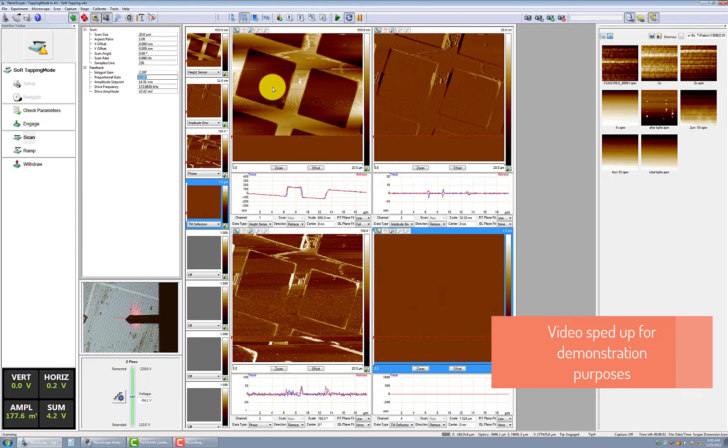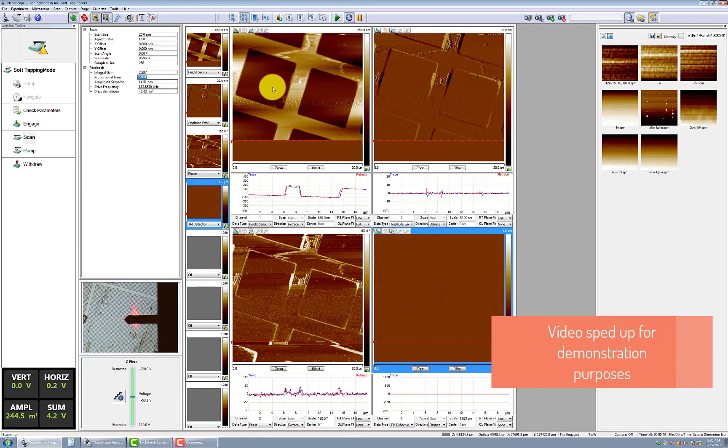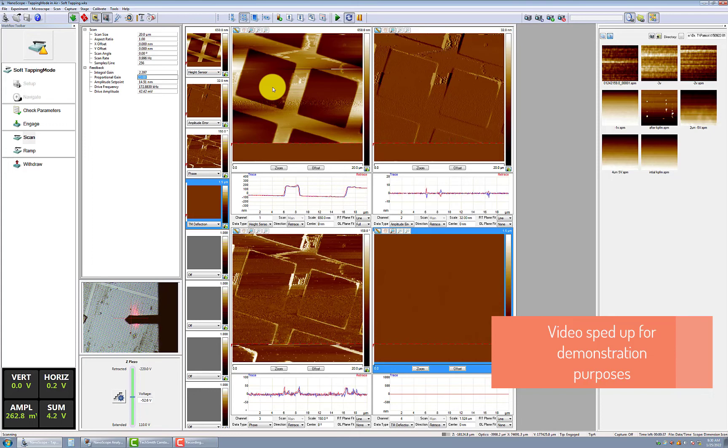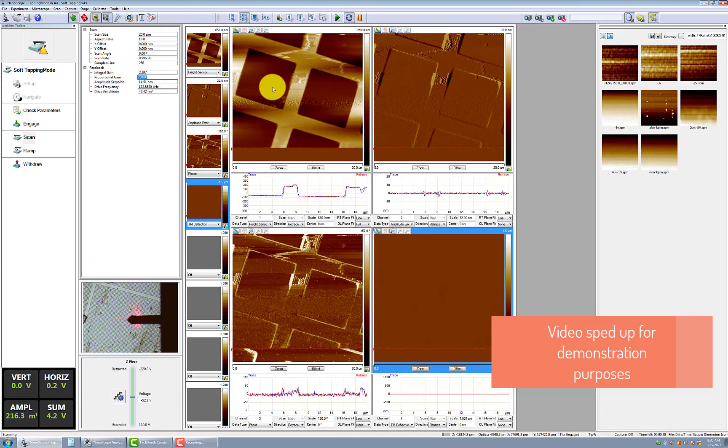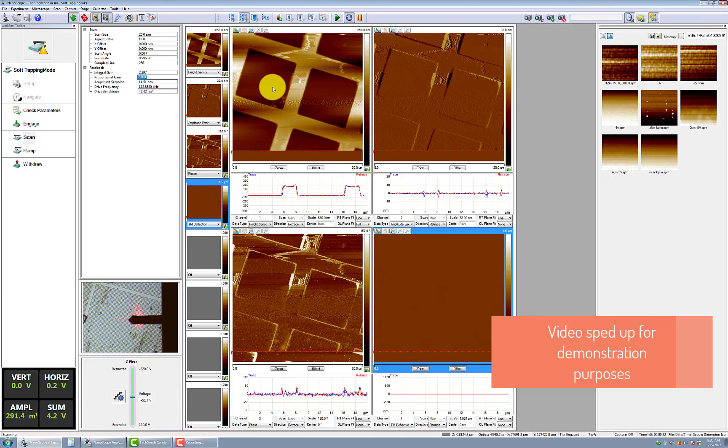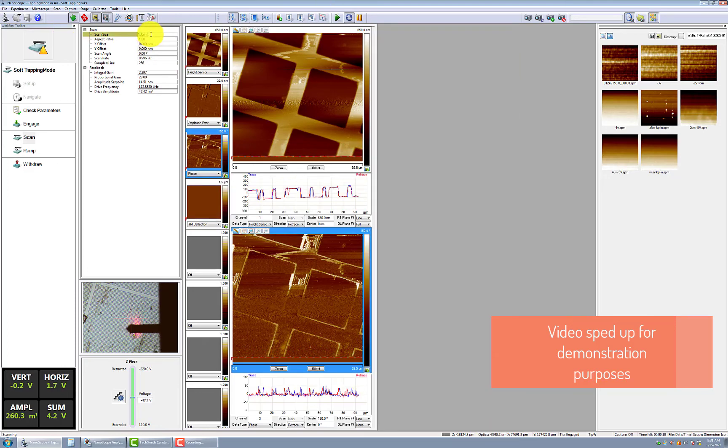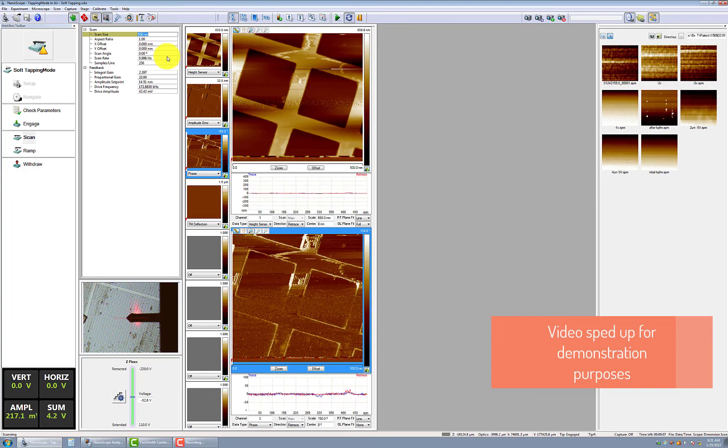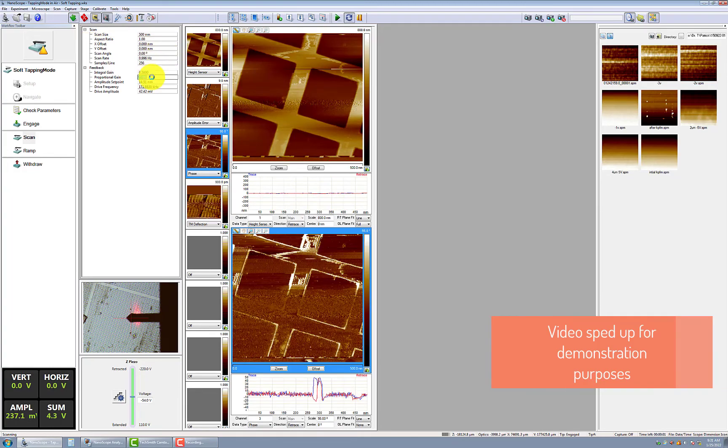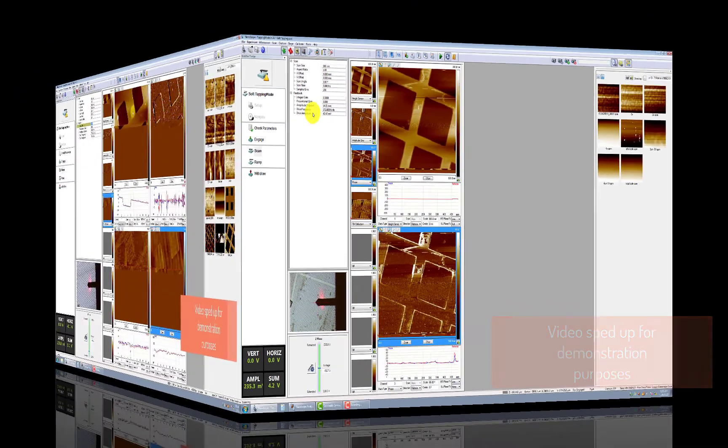Next, increase the scan size to the region of interest. A dialog box may pop up asking to confirm a large increase in scan size from the initial 500 nanometers. Also, you may need to make adjustments to the integral and proportional gain settings at increased scan sizes.